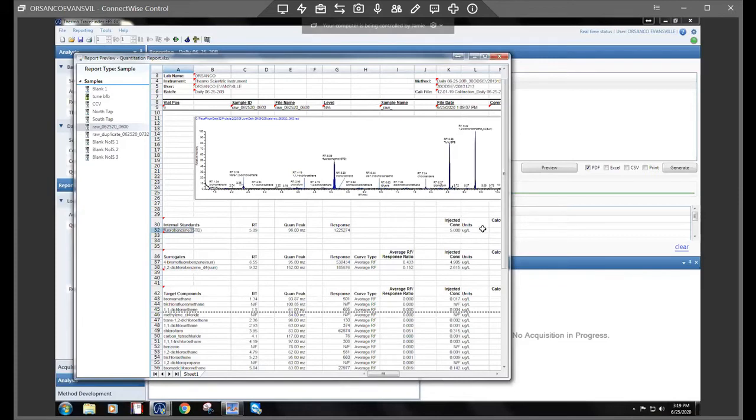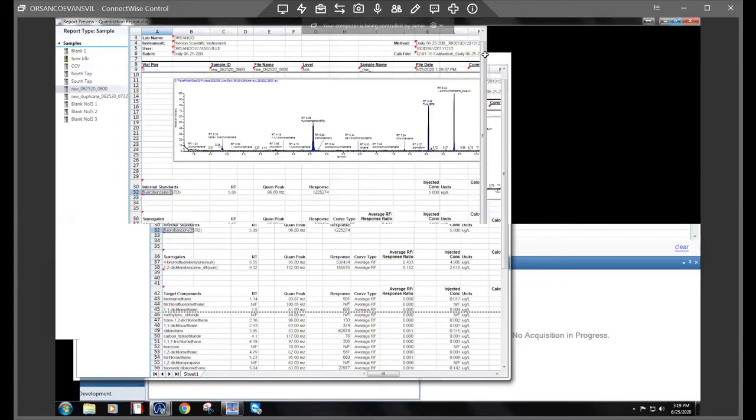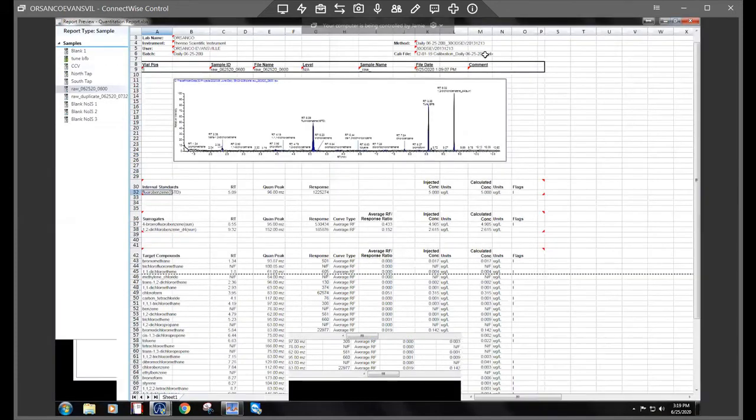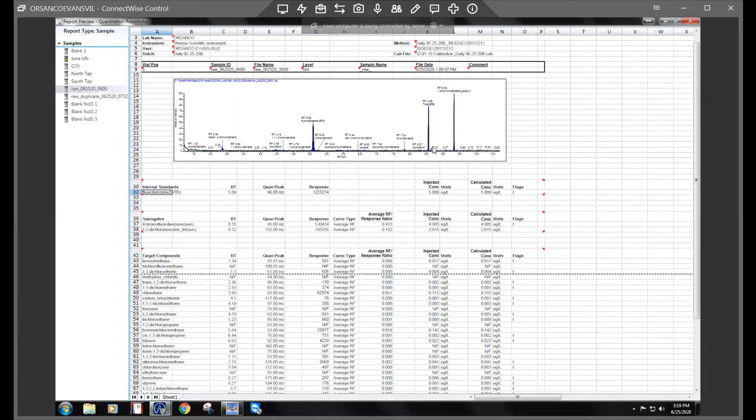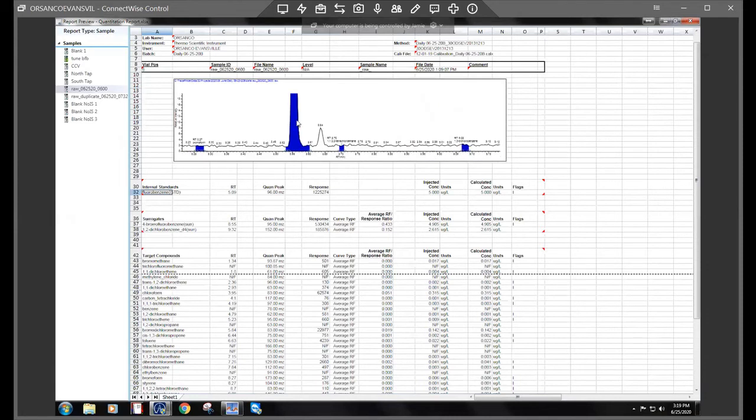So here's another example. This would be if you maybe see a little blip on your chromatogram and you're not sure if it's a peak or what it is. So this is a raw file here and I'm just going to go ahead and zoom in. Yeah, that looks like a little peak.